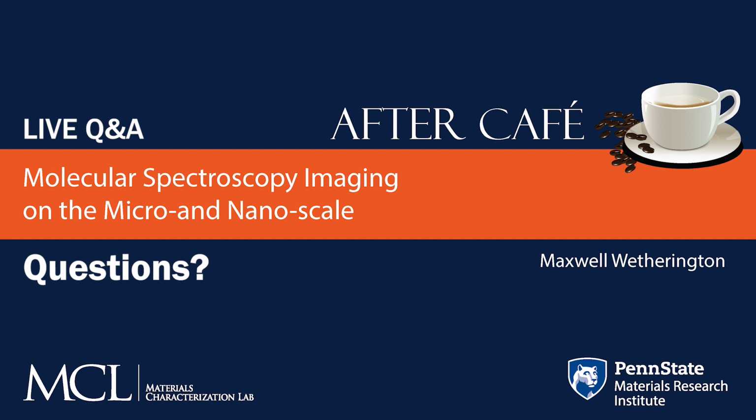We can prep in a number of ways. If they're large enough, I still feel that far field is a good place to start. Even if we think that we need to go to Nano-IR, because it is a bit more time consuming, we can still check your materials with Raman or micro FTIR. That could be a faster approach. But as far as prep for Nano-IR, there are different substrates we can use. If you have suspensions, we can drop cast onto gold, or IR transparent windows work as well.